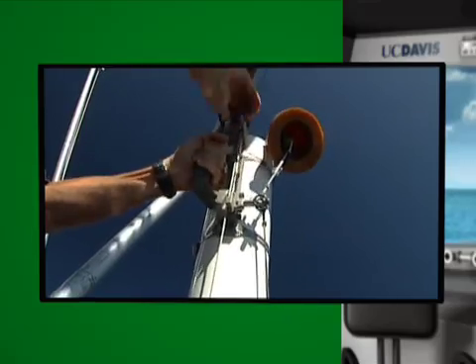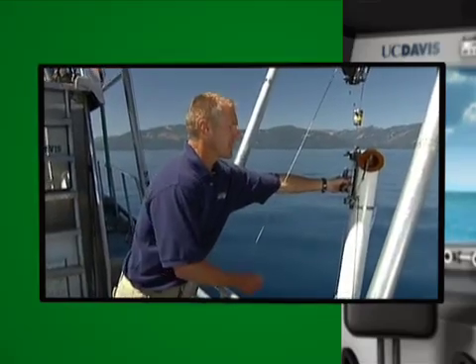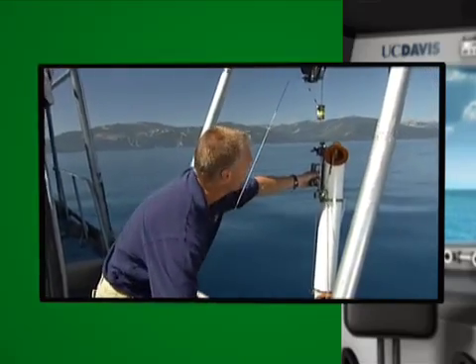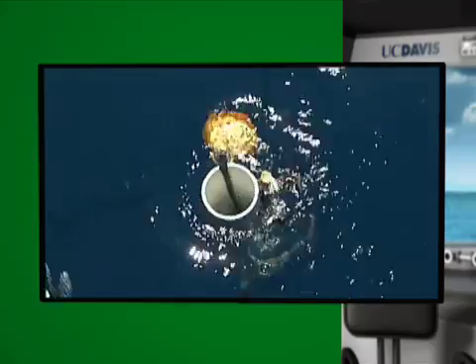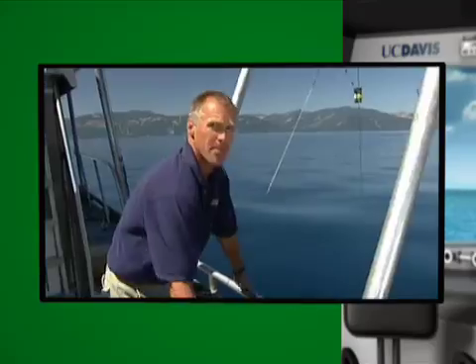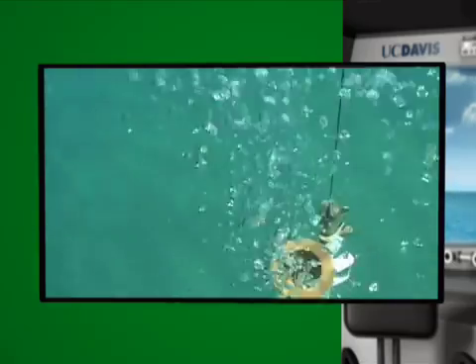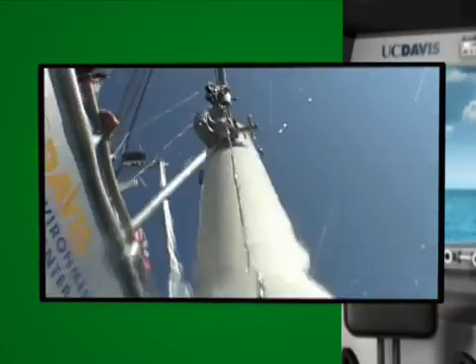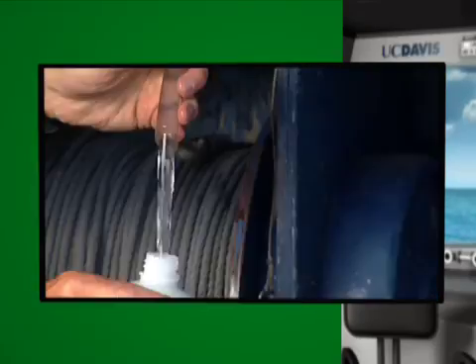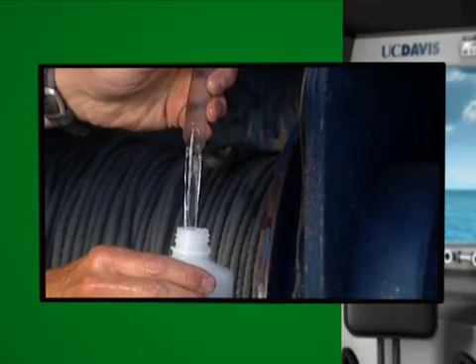This is another commonly used piece of equipment here at Lake Tahoe. It's called a Van Dorn sampler. We use this to collect water from a specific depth in the lake. We lower the bottle down to the depth that we need to sample, and once it's reached that depth, we send this weight down the line to close the bottle. As soon as the bottle closes, we've captured water that we need for analysis. This sample came from 1,500 feet deep in the lake. I'm going to send it back to the laboratory so they can analyze it for nutrients, fine sediment, and algae.